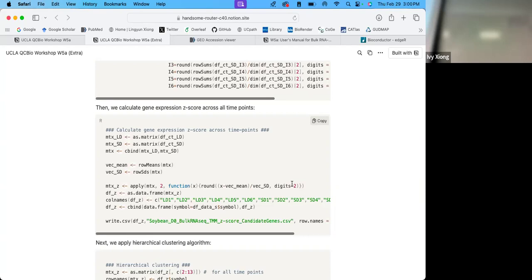Yeah, well, I did everything, this whole thing. Yeah, you can do it wrong, I think.